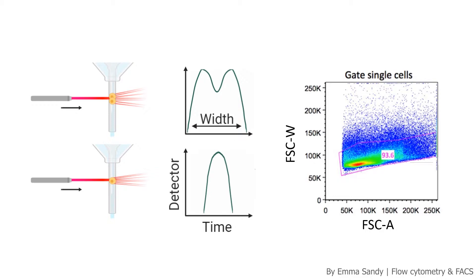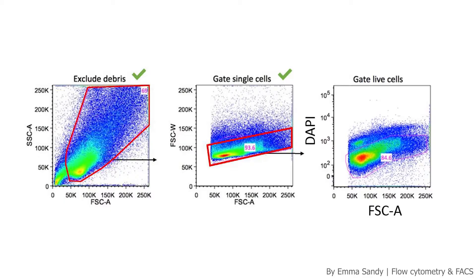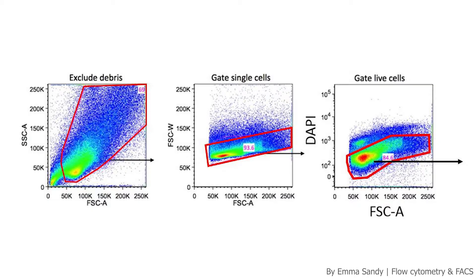Next we want to look at only the living cells. To do this you can use lots of dyes, and the most common one is DAPI. DAPI stains the DNA of cells but it can only pass into cells that are dead. So here we swap the y-axis for DAPI. You can see there's a section of dead cells at the top that have taken in the DAPI dye, and a population of cells below that haven't — those are the living cells. We select the living cells and take them forward for the next analysis.